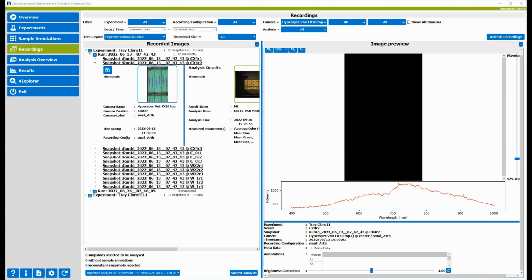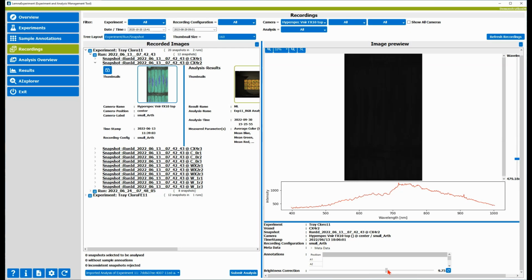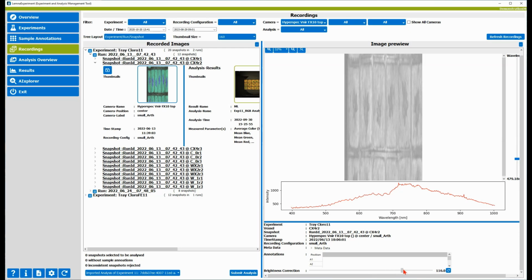Since we split the light into many wavelengths during the recording of a hyperspectral data cube, the intensity at each wavelength is smaller than on an RGB or grayscale image. Therefore, you shall use the brightness slider to actually see the data. Please note the data shown here are the raw data. They are not processed by normalization using the white and dark reference.